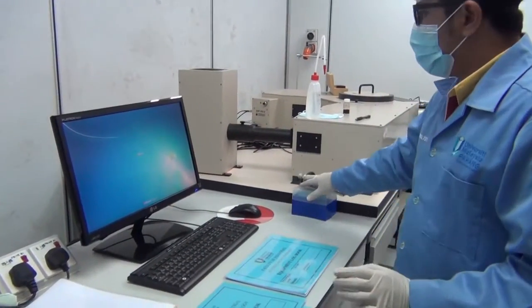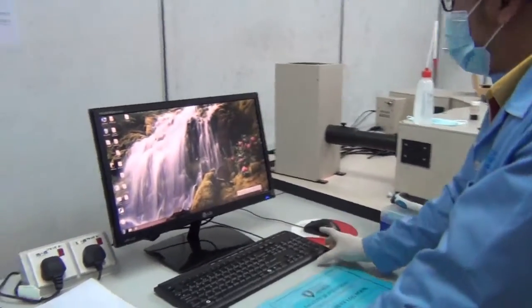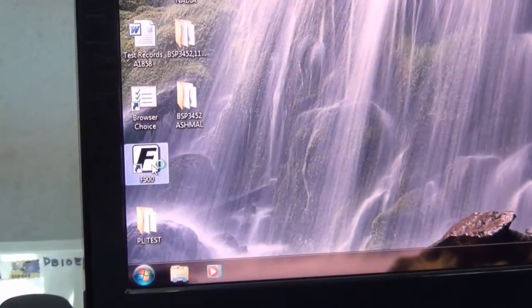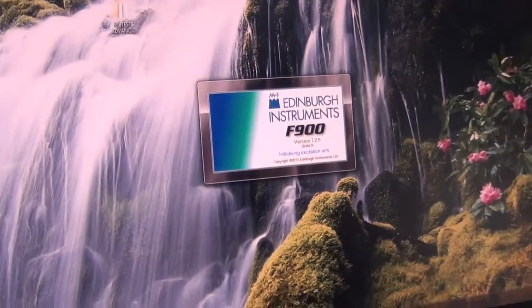Right? So let us start the machine. Now, what you need to do is to click on the F900 icon over here. This will start the machine. Click it and let the machine start up and warm up.